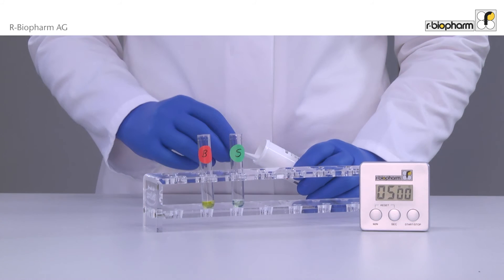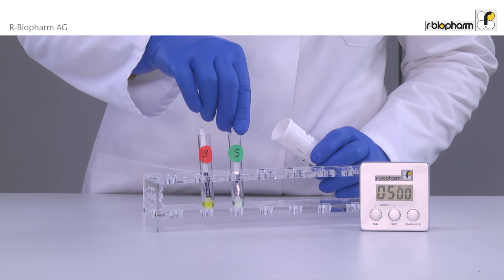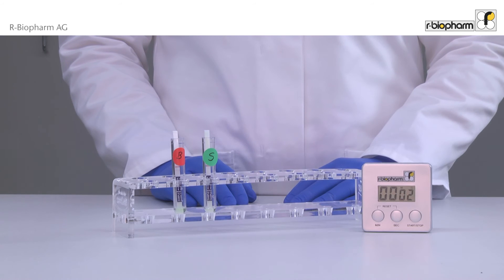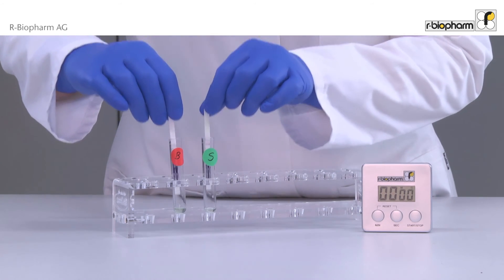Use gloves while placing the dipstick vertically with the arrow end into the test tube. Incubate the strips for 5 minutes. Take out the strip exactly after 5 minutes and read the result immediately.